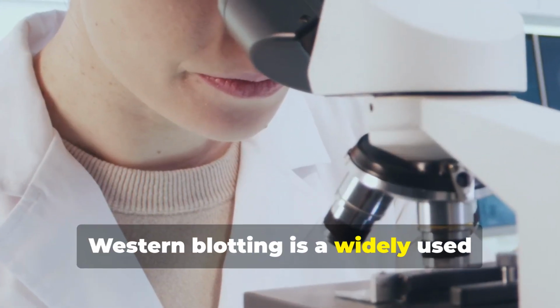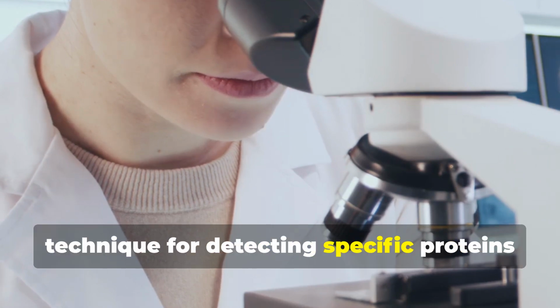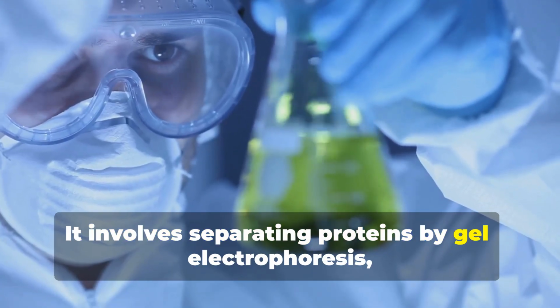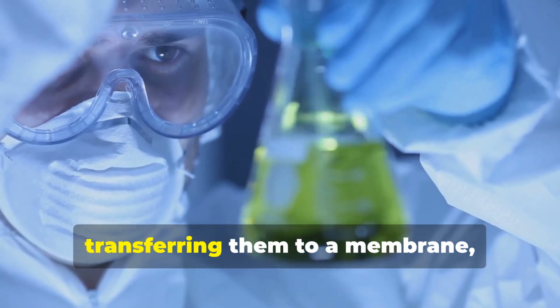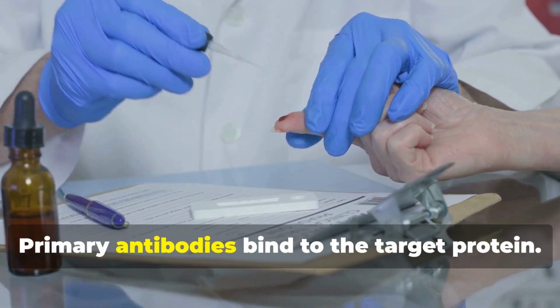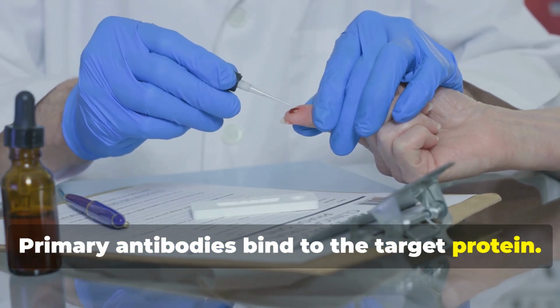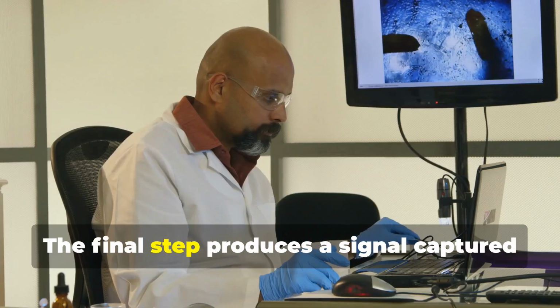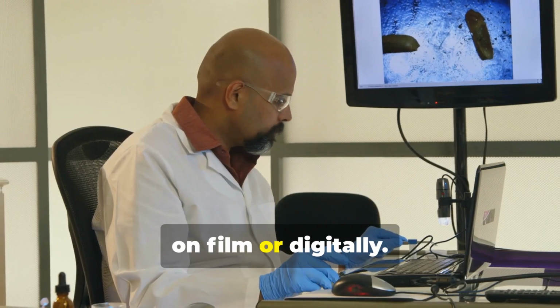Western blotting is a widely used technique for detecting specific proteins in a sample. It involves separating proteins by gel electrophoresis, transferring them to a membrane, and detecting them with antibodies. Primary antibodies bind to the target protein. Secondary antibodies with enzymes or dyes are added. The final step produces a signal captured on film or digitally.